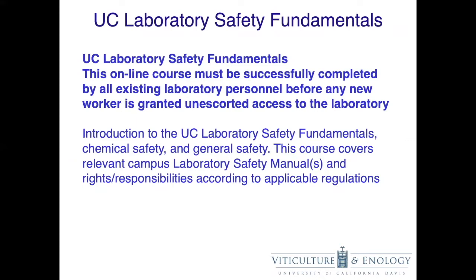UC Laboratory Safety Fundamentals is an online course which must be completed by all laboratory personnel before being given access to the laboratory. It is an introduction to laboratory safety fundamentals, chemical safety, and general safety. It covers relevant information discussed in the UC Laboratory Safety Manual and rights and responsibilities according to applicable regulations.